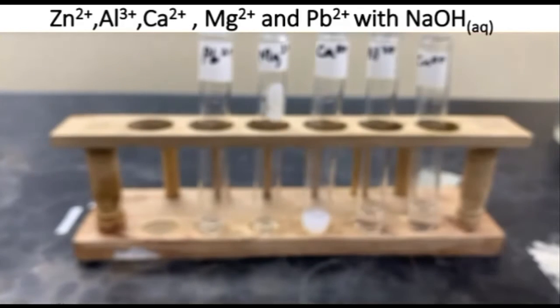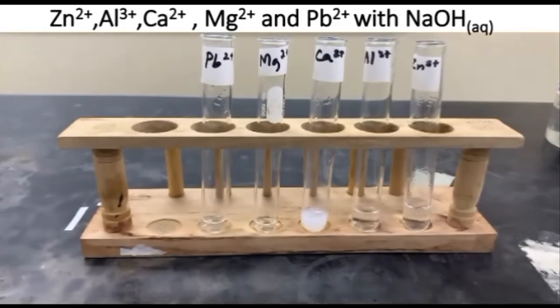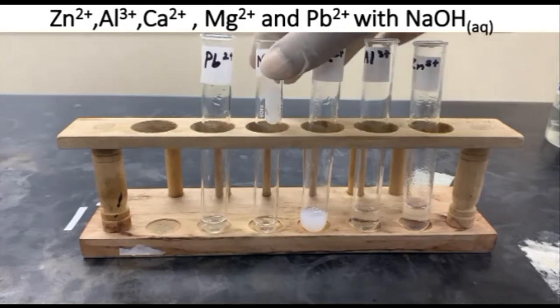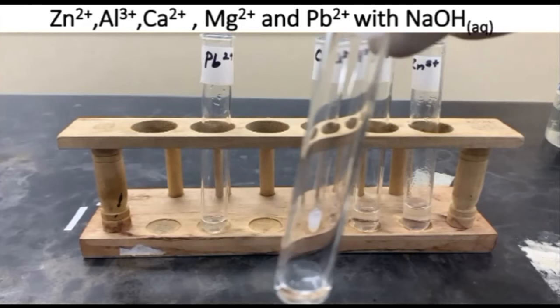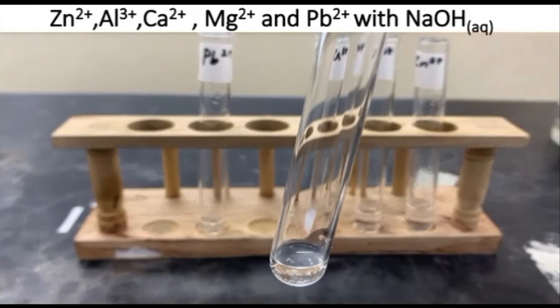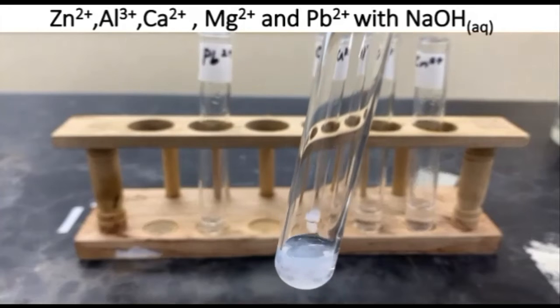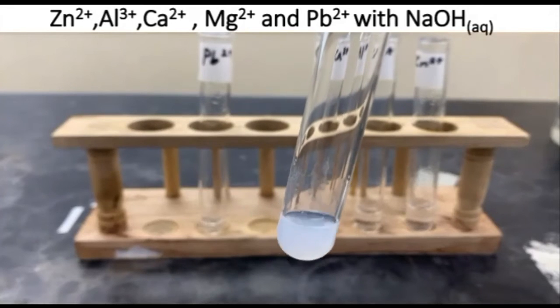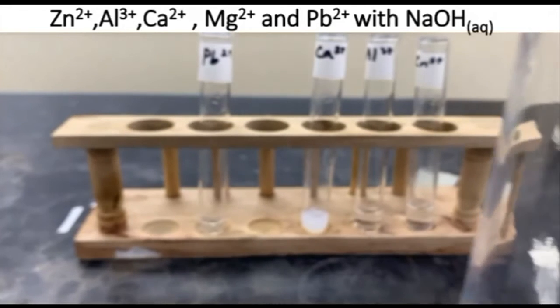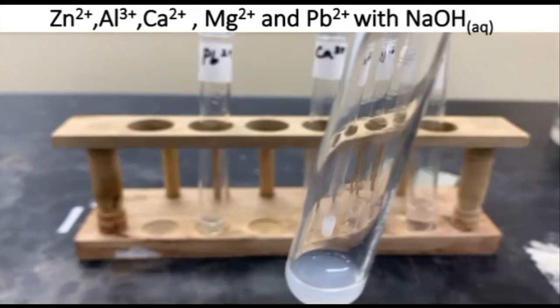Right, so this takes us to magnesium. We're going to add again a few drops of aqueous sodium hydroxide. We get our precipitate. We're going to pour off most of the mixture so we can add our sodium hydroxide in excess.